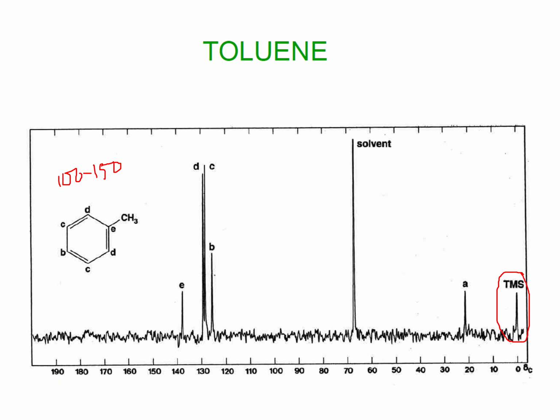So in 100 to 150, how many peaks will we have? It will be based on its orientation. First of all, it has one environment, it has another environment, both of them have another environment, they have another environment, and the last one has another environment. So how many peaks would there be? There would be 5 peaks, 1 2 3 4 5. So one CH3. CH3 will be located around 0 to 50. We already know that. So this is the CH3. One carbon has gone.